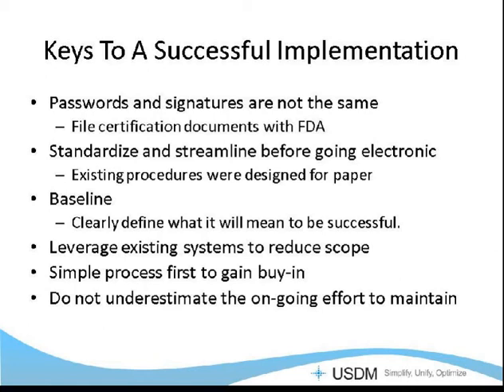You can also use SDMSs for archiving. The ELN can definitely generate a lot of data and big files, and you need to come up with an archiving strategy. And if you have an SDMS system that handles these types of things, or a document management system, you might be able to leverage those to take some of the pressure off of the system.